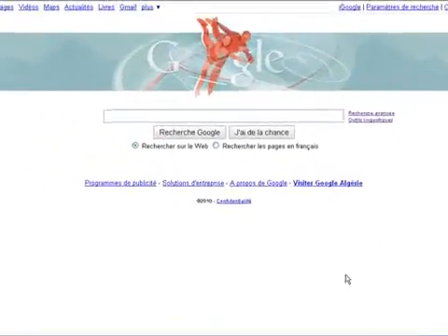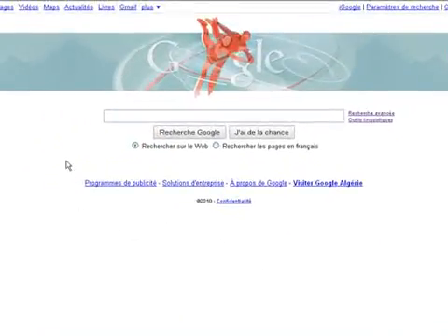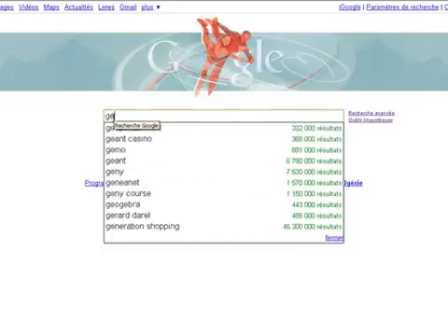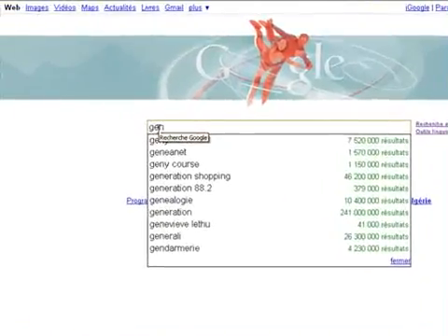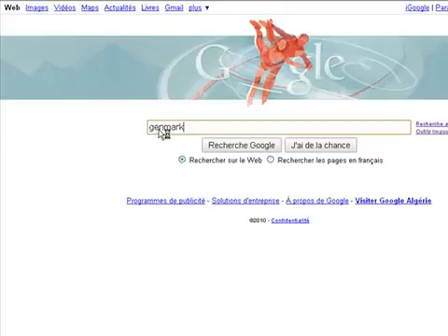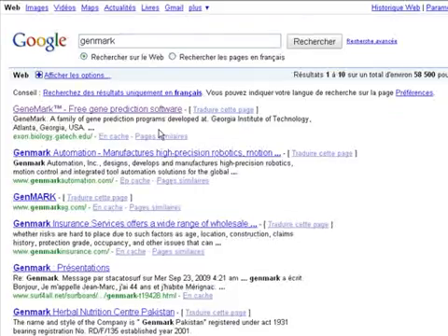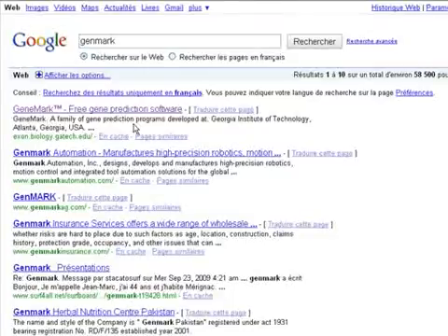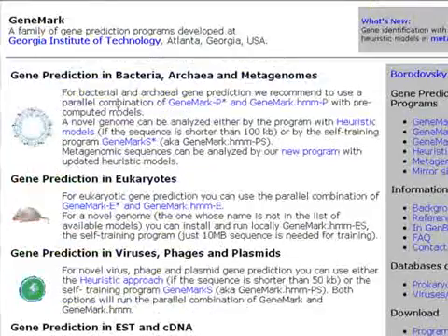The first thing to do is to go to Google as usual and type our software name which is GeneMark. We hit enter. As we can see here on the first hit, GeneMark is a family of gene prediction programs developed at Georgia Institute of Technology at Atlanta. We click on the first hit.